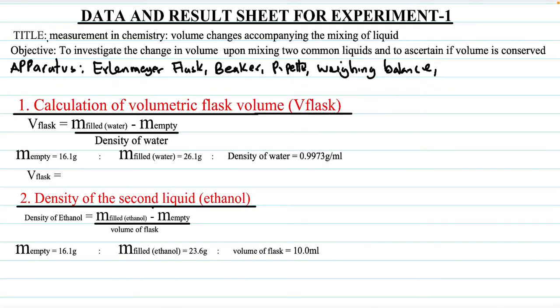So you come back here and then your reagents, very important. Reagents, we had ethanol and we have water. Please, your date is very important. Make sure you put your date. All right, after which you can now start your calculation.